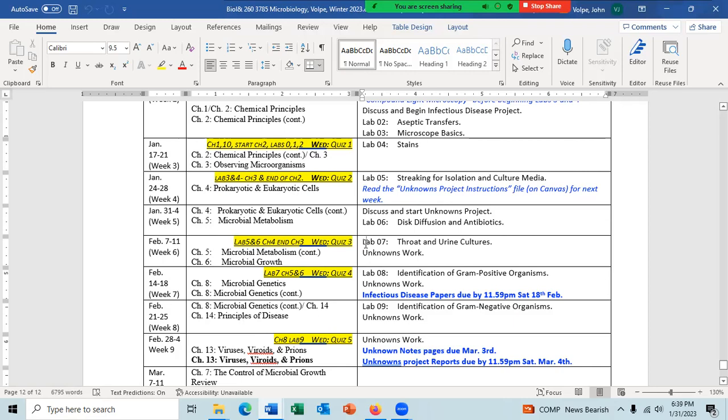Okay. And then you will look at those results, try and figure out what species are under consideration, and then you will determine your next test to run. Okay. So after a week's time, everything will be due to you choosing which test.